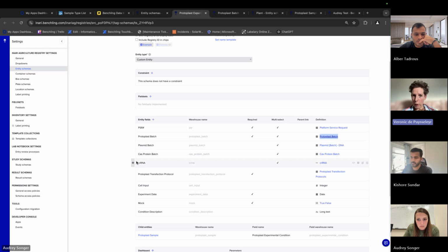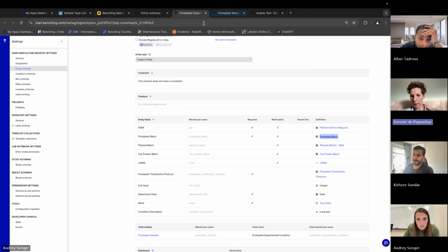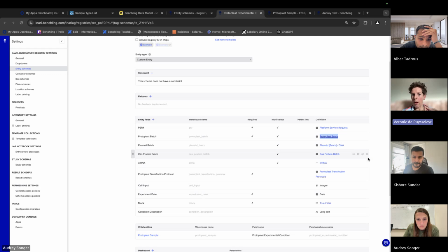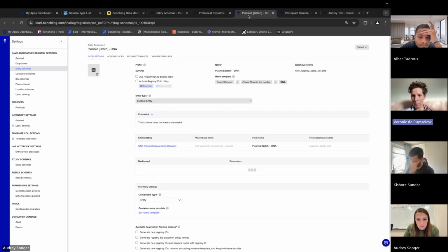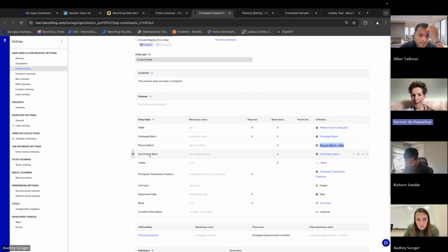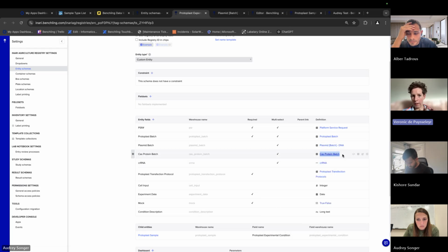So I will explain to you so that you understand it. There are 3 ways of doing this kind of experiment. You can take your protoplast and transfect it. You can add a plasmid only. That's the first way, so then all the editing machinery is on the plasmid. The second way is that you take your cells and apply a Cas protein batch and a guide.